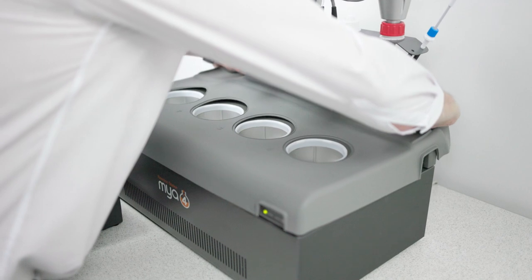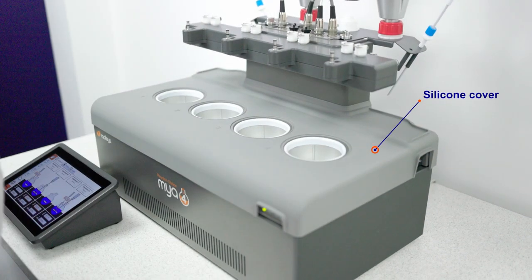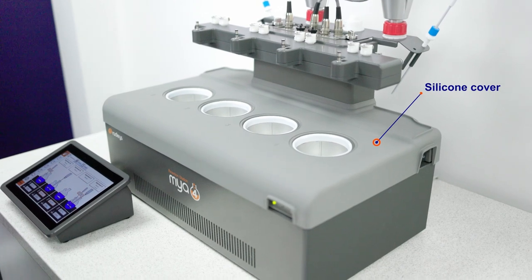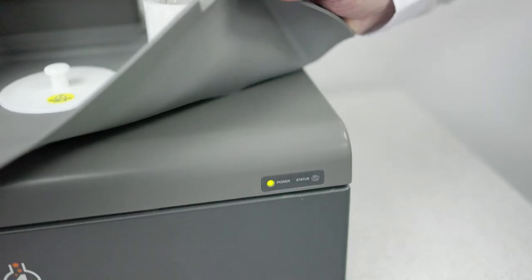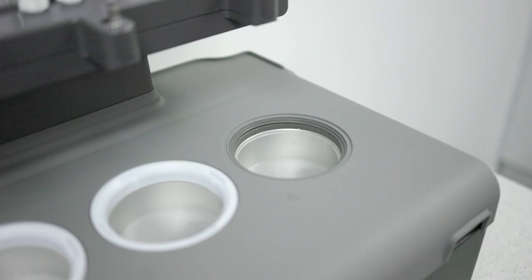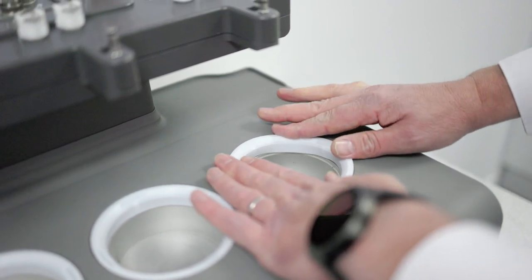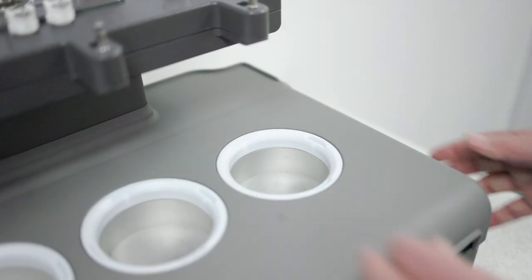The silicon cover provides an additional barrier against chemical contamination or staining and further protects the top of your Maya 4. When using the silicon cover, you'll need to use our new zone rings, as the silicon cover raises the height from the top of the Maya 4. The new zone rings are included in the kit.